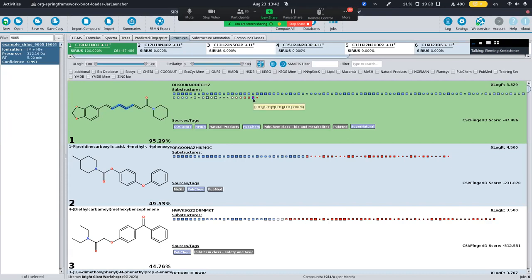Another thing to know is that the boxes have different sizes, and depending on how big they are, the size of the boxes also denotes the quality. Smaller boxes are not that trustworthy. So don't worry if you also have some red boxes for a good hit. This just means that the predictor might not be the best.